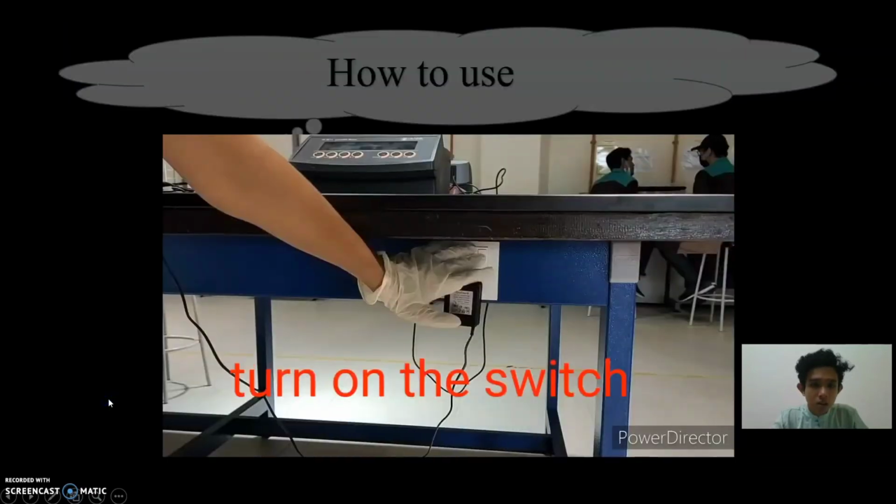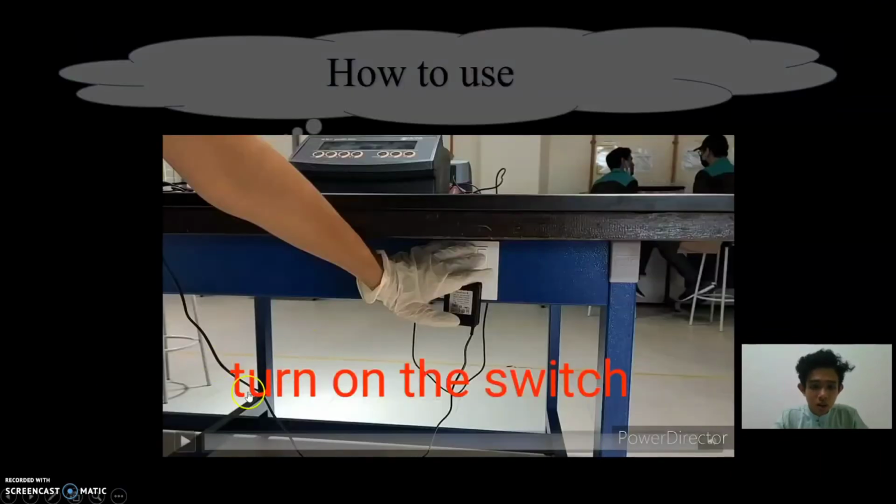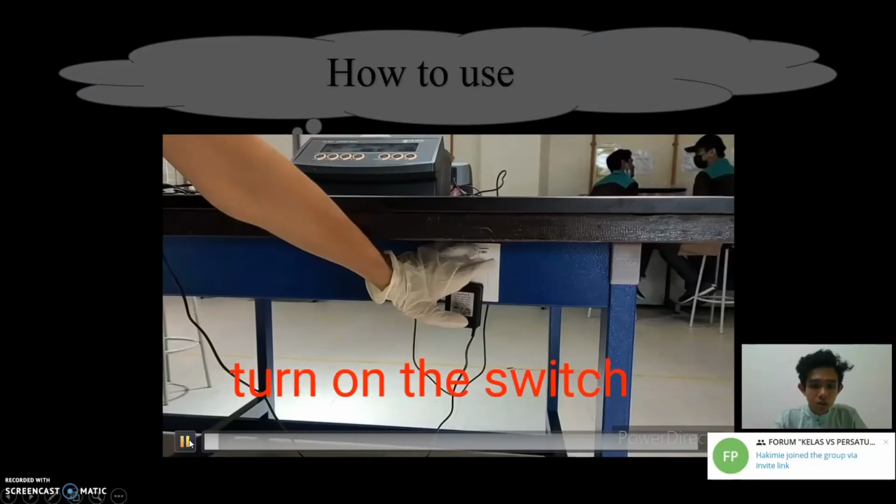And the next is the pH meter. The function is to measure the pH value of the water. This is the pH meter. Okay, let's see the video.